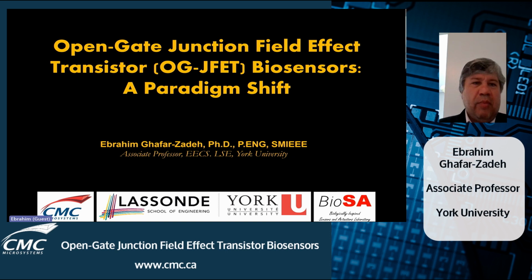So today I want to talk about the Open-Gate Junction Field Effect Transistor. The fabrication of these sensors has been facilitated by CMC, and we have used these sensors for various applications. Today I will share with you a number of the applications.